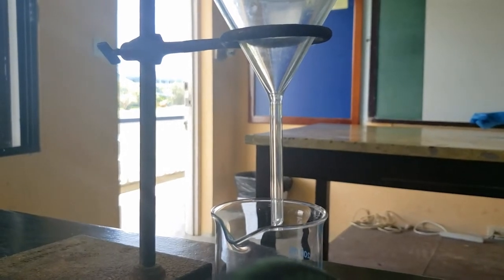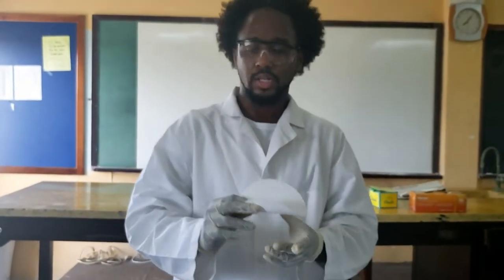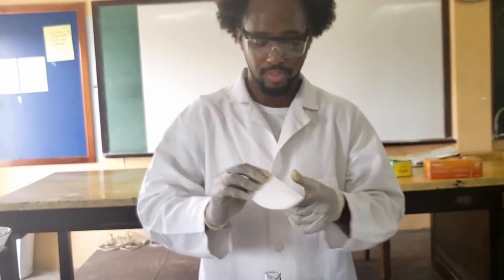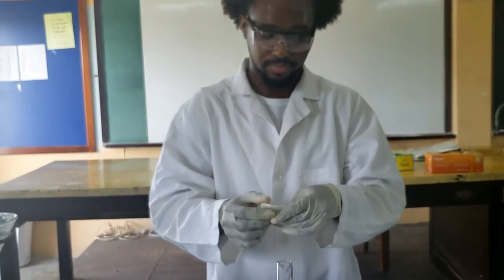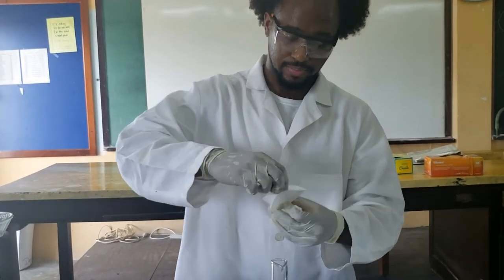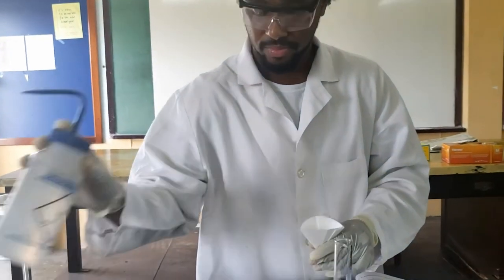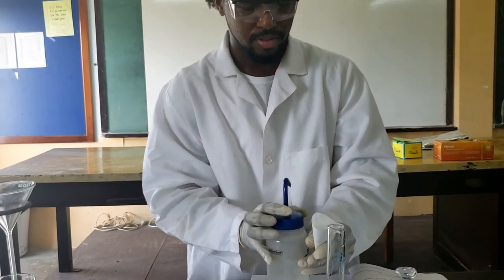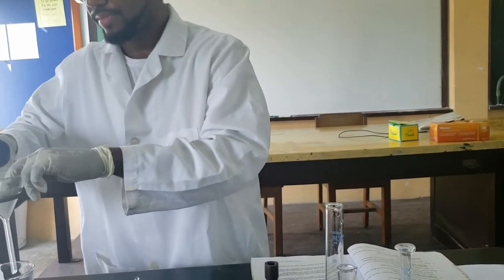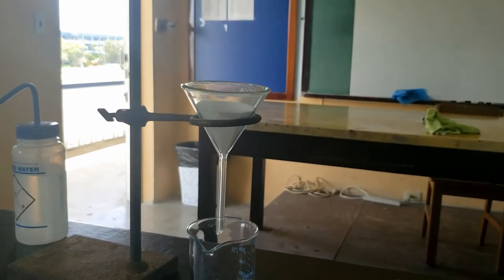We are going to prepare the filter paper. We have some qualitative filter paper here — to prepare it for the funnel, you just first fold it in half, then fold again, so you fold it into quarters. Then you take one of those sides, open it, slightly pinch the bottom, set it in, and you just dampen it a bit. That way it stays in, and you should be ready to start filtering.